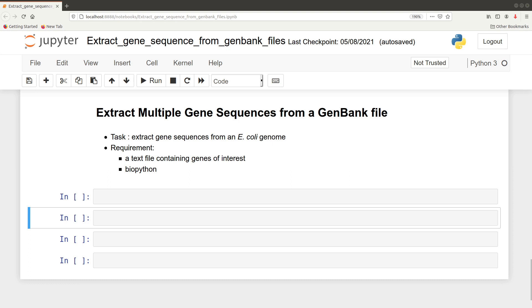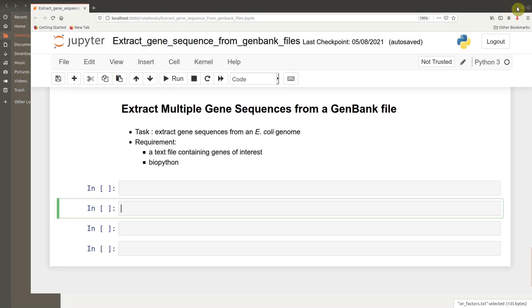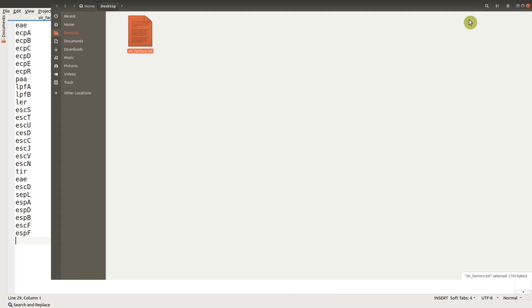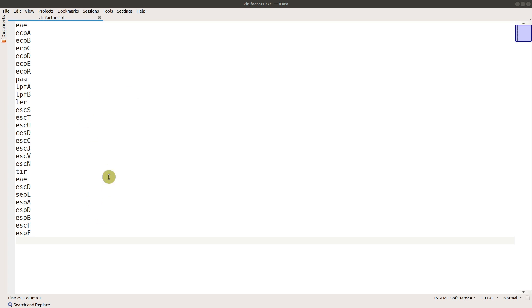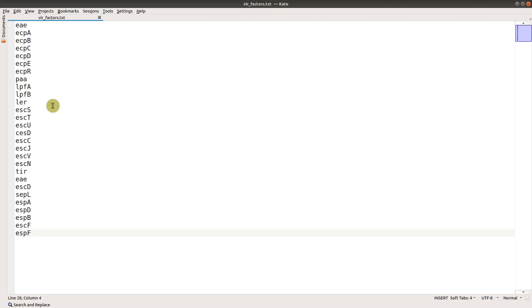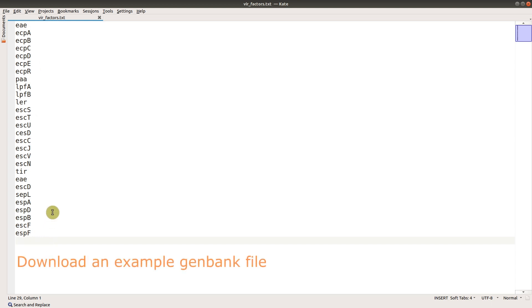Let's quickly look at the genes that we are going to extract. Here's the file - it's a text file and I have the list of genes in them. These are virulence genes that can be found in E. coli strains. If you have your gene list, you need to arrange it as I've done here - each gene name should be in a separate line so that Python can easily read it.